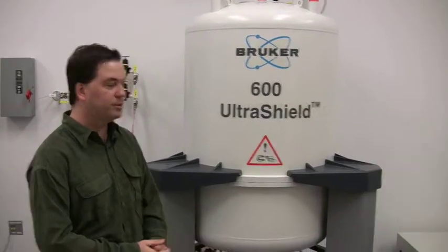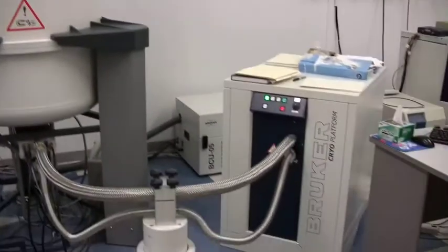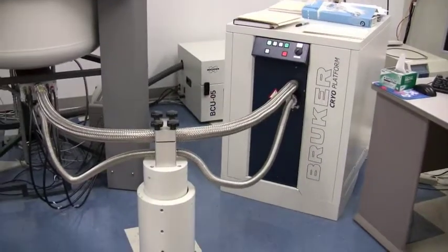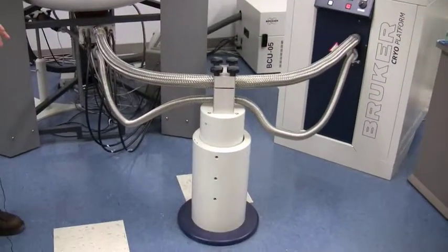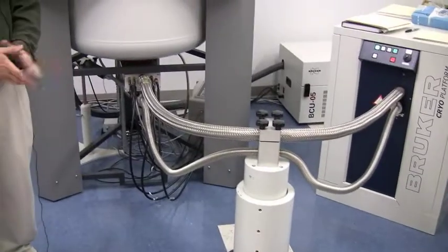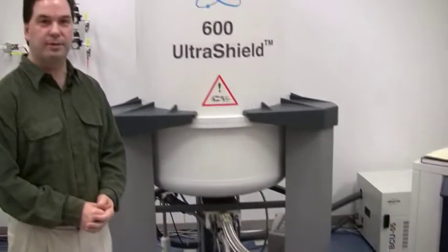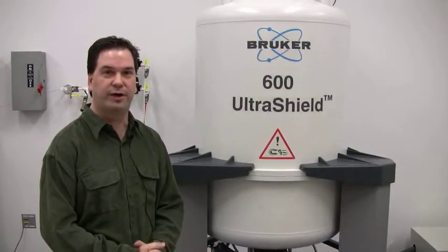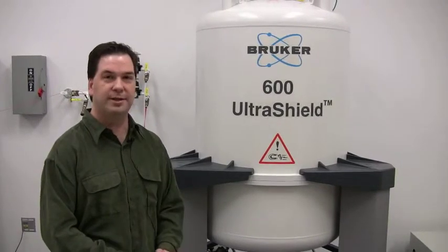This cryoprobe accessory works by cooling the important NMR components that we use to detect the signal, namely the NMR coil and the proton preamplifier to liquid helium-type temperatures, which is around 23 Kelvin. Once they're cooled to that temperature, the source of thermal noise is removed.